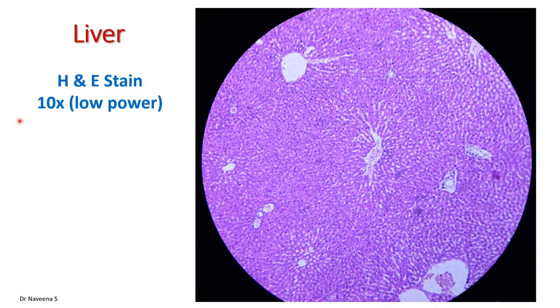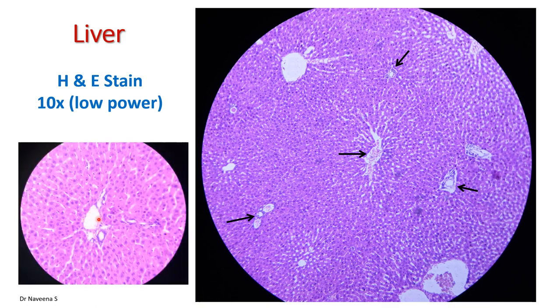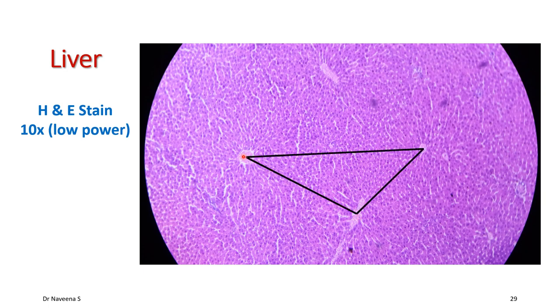Looking at the liver tissue under low power with hematoxylin and eosin stain, we can see the central vein with radiating hepatocytes and sinusoids, and portal triads showing a portion of the classical lobule. Under high power, portal triad structures are identified: a larger-lumened portal venule, a thick eosin-stained hepatic arteriole, and a cuboidal-epithelium-lined bile ductule. The portal lobule can be identified by joining adjacent three central veins on the H&E stained tissue.